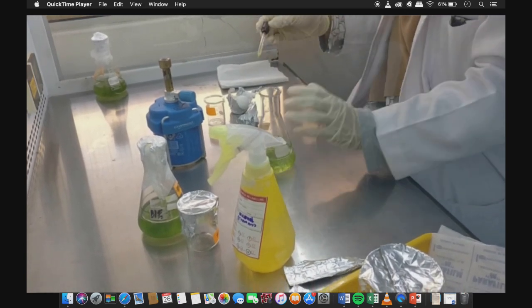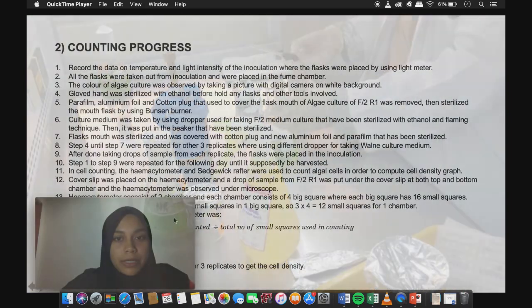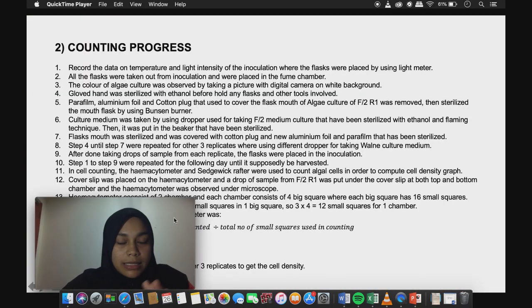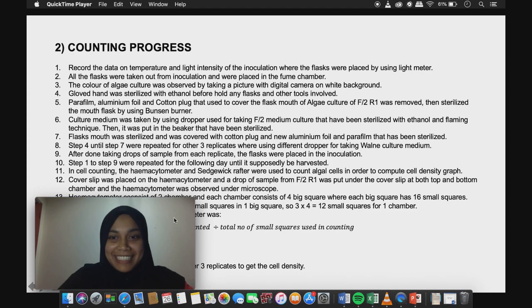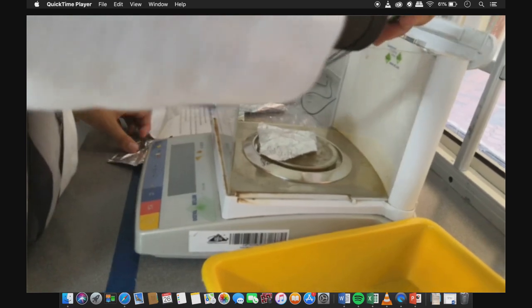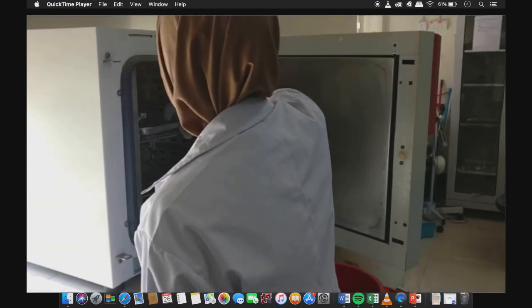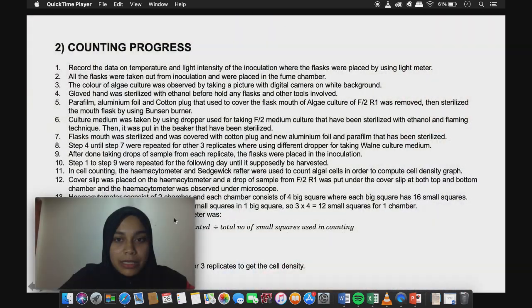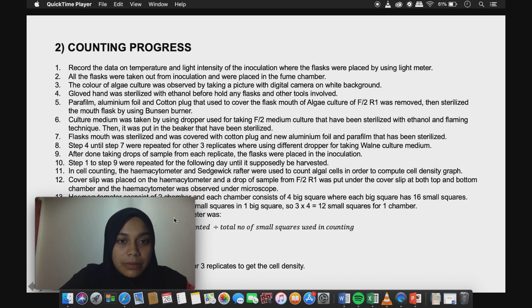The color of the algae culture was observed by taking a picture with a digital camera on a white background. For the counting process, all flasks with culture had their parafilm and aluminium foil removed from F2 R1, and the mouth of the flask was sterilized using a Bunsen burner. The flask medium was taken using a dropper sterilized with ethanol and the flaming technique, then placed into a sterilized beaker. The flask mouth was then covered with a cotton plug, new aluminium foil, and parafilm.